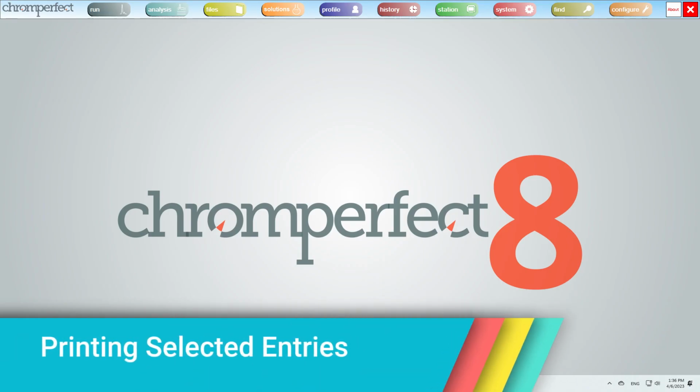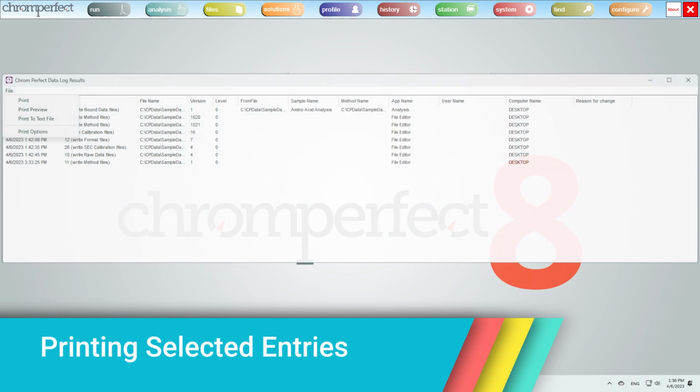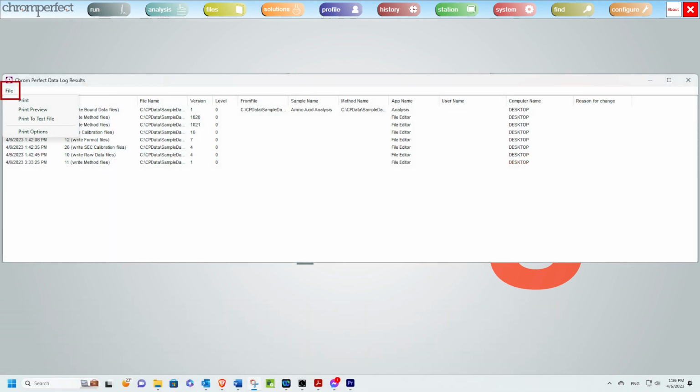Printing selected entries. The display forms contain a menu bar with a single menu, File. Under this menu are 3 print items that will send the displayed entries to the printer, the preview form, or a text file. 1 line is printed for each entry. In most cases, it is not necessary to print every column.